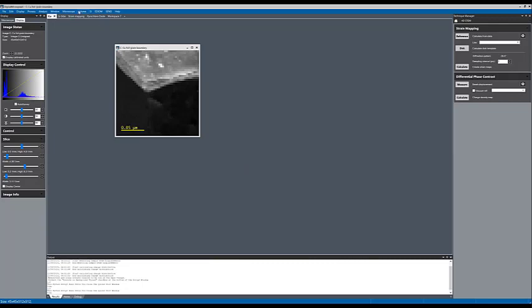Another way to reduce your data is subsampling. You can do subsampling again in all of the 4 dimensions. I think it makes more sense if you do the subsampling in the spatial dimension.